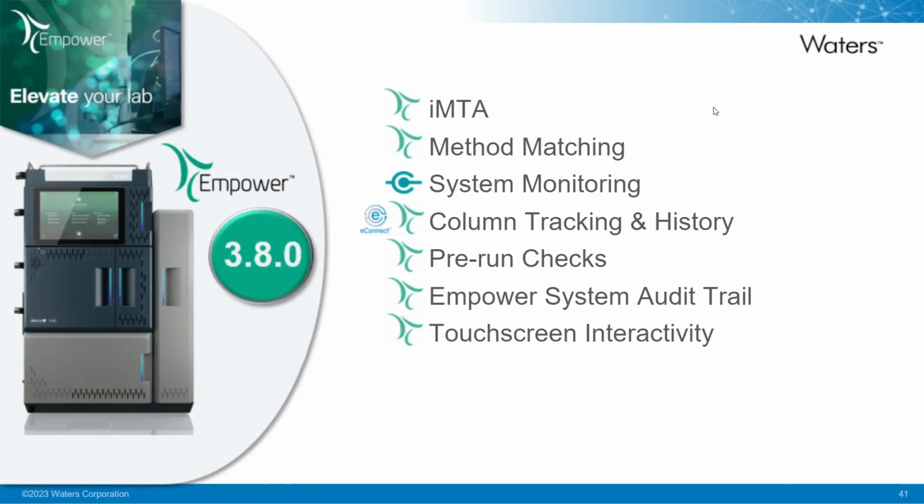Okay, so these are some of the tools that we can take advantage of to streamline the process, make the process a little simpler, remove some of the human intervention that may be needed. Now, of course, if something is flagged as requires review, obviously then we have to go in and take a look at that result. So we took this a step further.